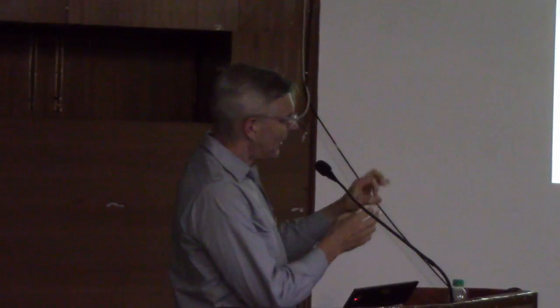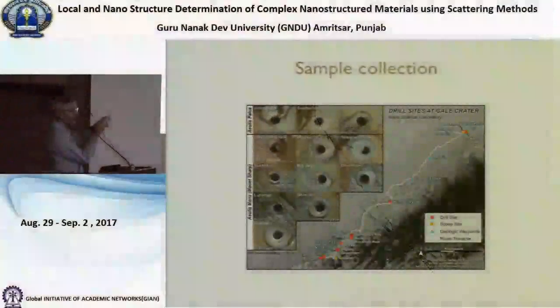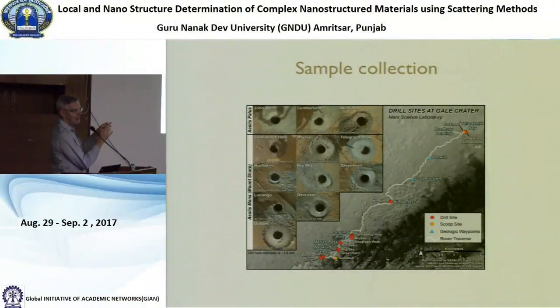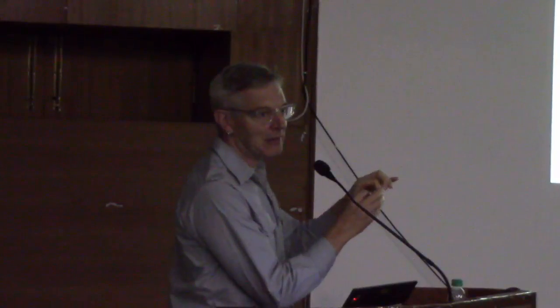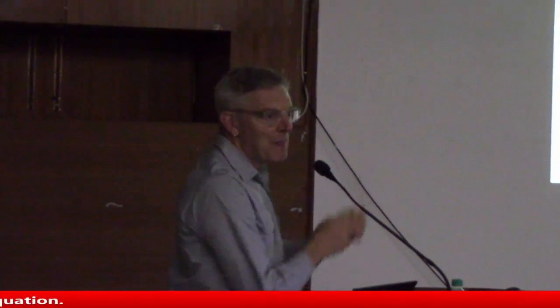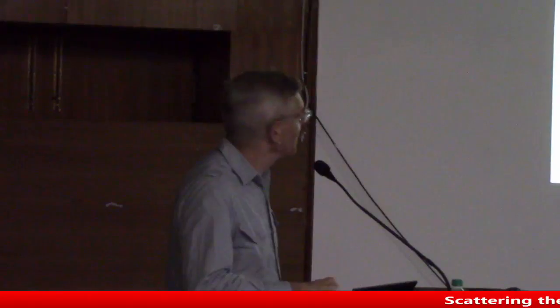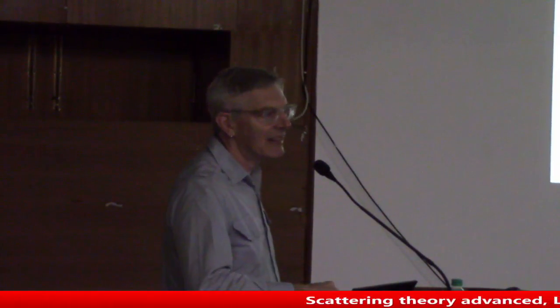That does two things. It disperses the powder throughout the region, so the powder is flying around inside. And second, you get much better orientational averaging because each powder grain is flying through the air and rotating. So it's very ingenious. It's a beautiful piece of science where people used their imagination and came up with a creative solution.